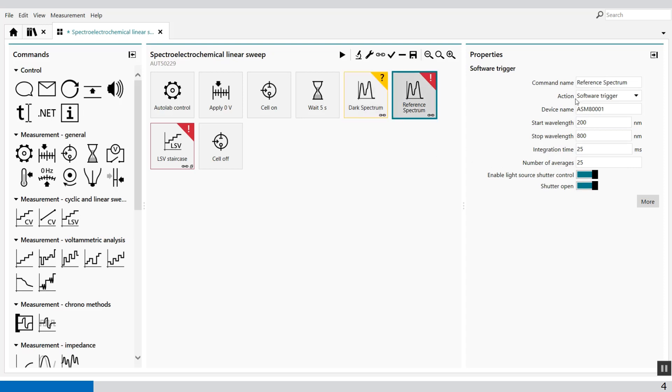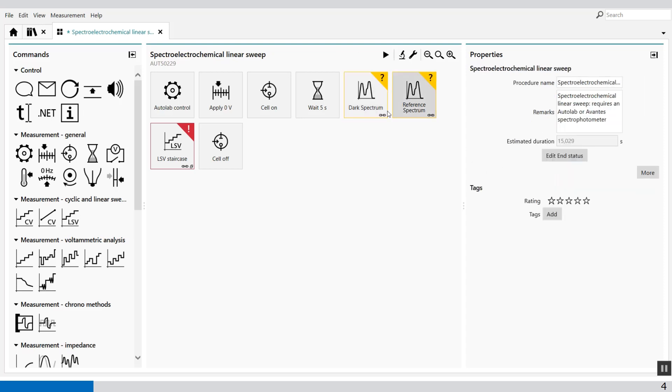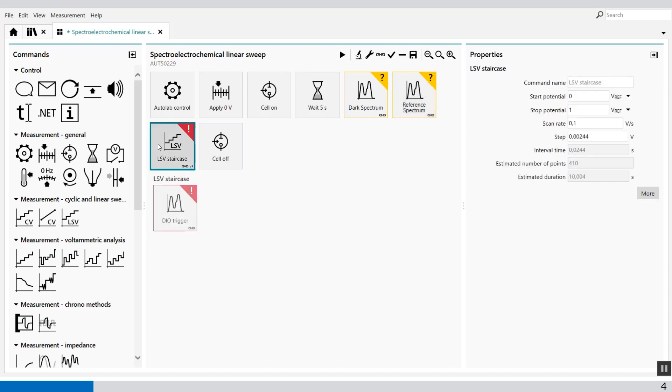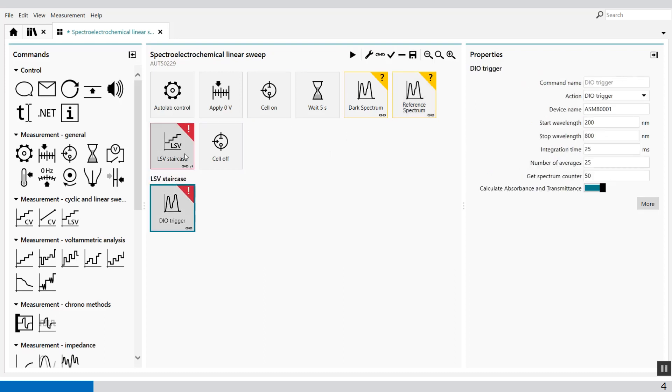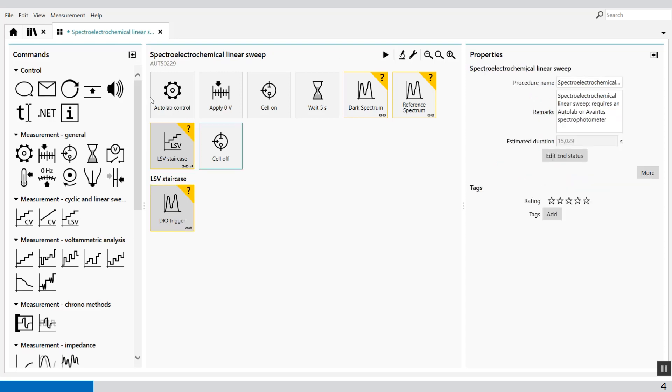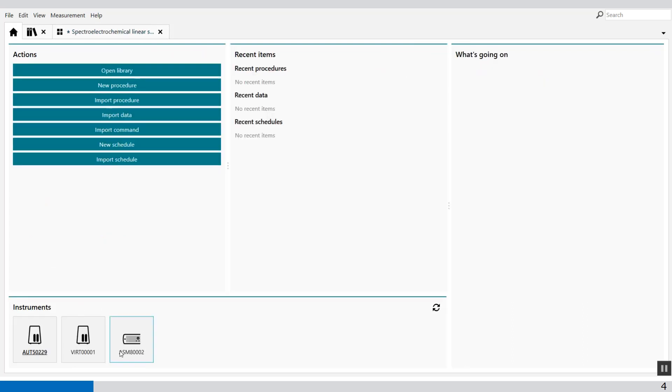When I change this in all the commands you will see that the error is changing like this because I'm using ASM80002.